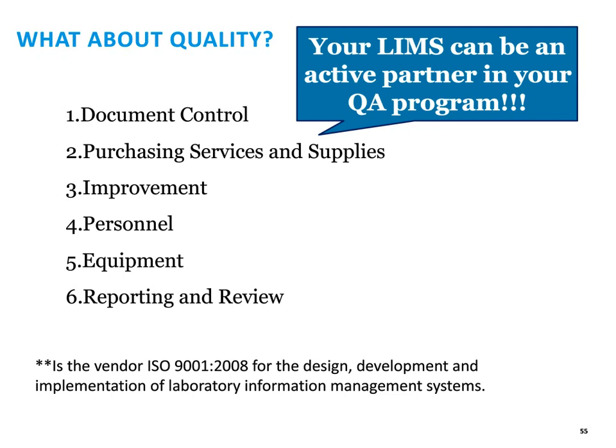Very important that you check that your vendor is ISO 9001:2008 certified for the design, development, and implementation of laboratory information management systems. Laboratories, crime laboratories, are held to very high standards with ISO 17025. Make sure your vendor is also holding themselves to a very high standard.